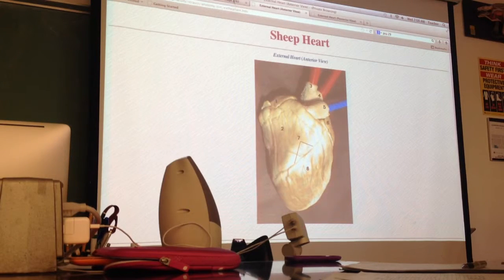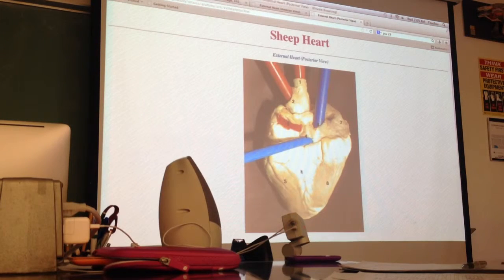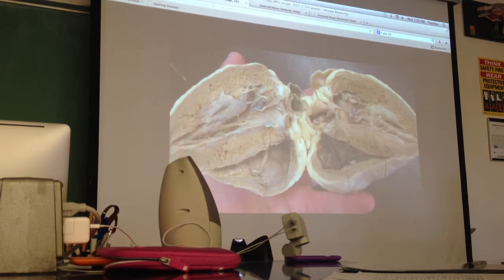Okay, so now let's see what this looks like when you cut it open. We're going to be bisecting it, cutting the anterior portion off of the posterior portion, so you cut it in half that way. This line is a great way to cut around, but because it's at a slant, that can sometimes create an awkward cut, so I like to use the back, since this line goes straight down. You cut around like that, cutting the front off of the back. In doing so, you'll be able to see both ventricles at the same time. If you cut it any other way, it gets kind of awkward looking.